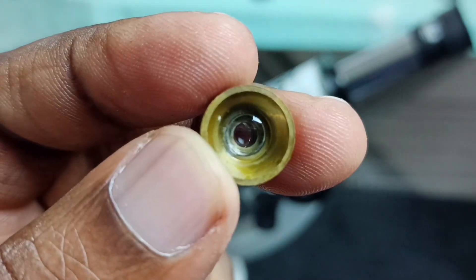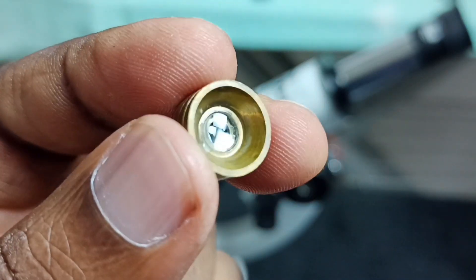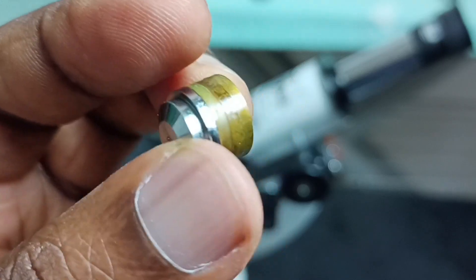So this way we can open the objective lens of a microscope and clean it.